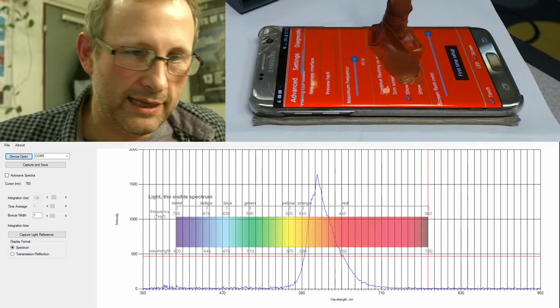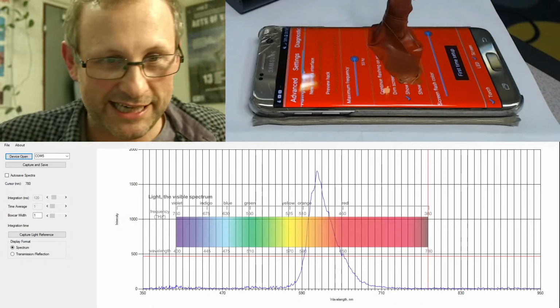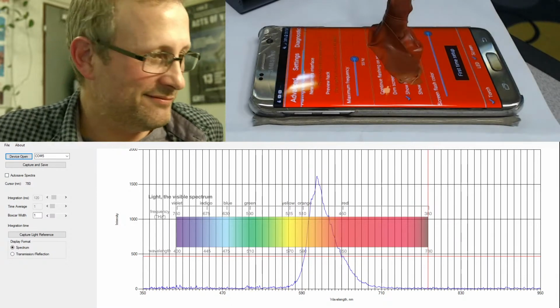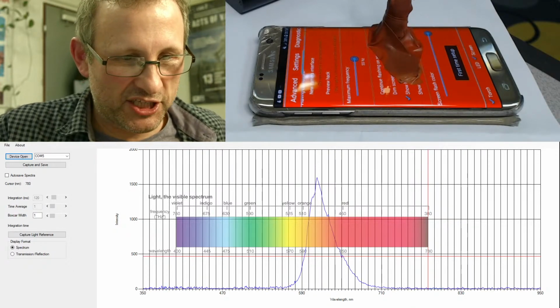So you can see that when I'm looking at this with my own eyes, I can tell you it's actually quite orange. So the webcam up here is picking it up as red, but it is actually quite orange. So what you're seeing actually fits that better.